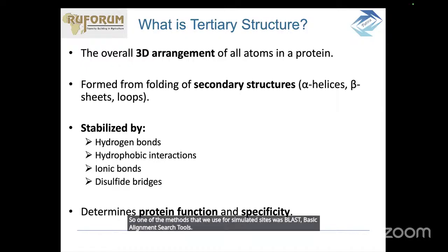And we discussed different types of BLAST, and the most common ones are BLAST-N. BLAST-N uses DNA. So you have your query as DNA, and then you query the database, also DNA. And then for our activity, we used protein. So that is BLAST-P. So the query is the protein, amino acids, and then the database is also protein.